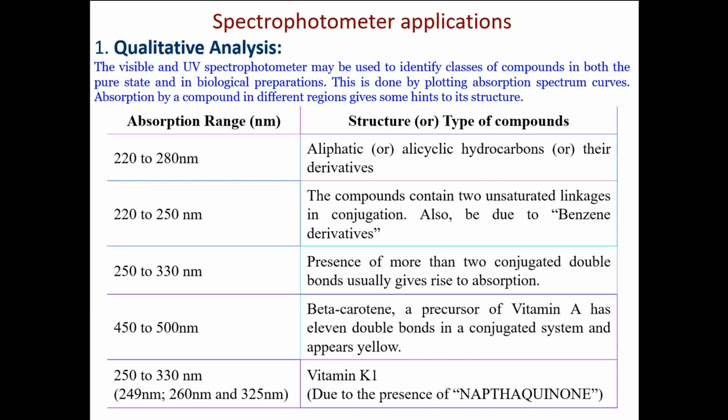That means you can isolate samples from soil, and then you can subject that for the characterization of the compound. So you are not extracting these compounds from the biological systems, I'm saying.